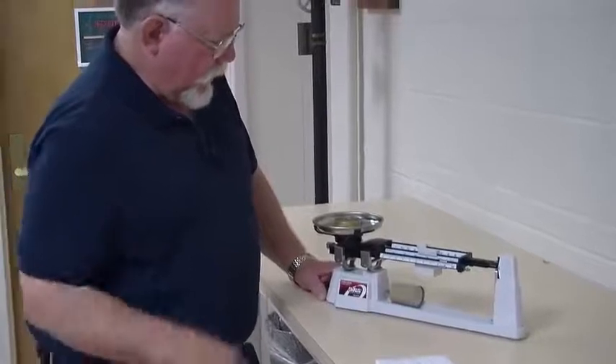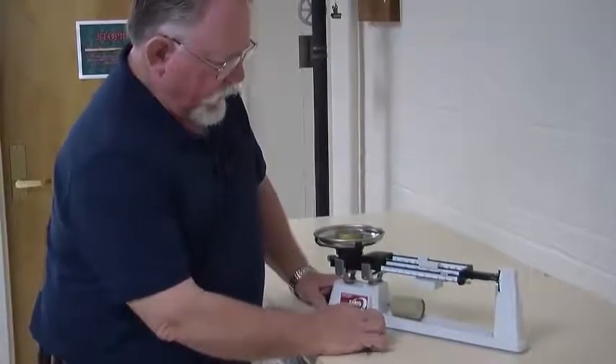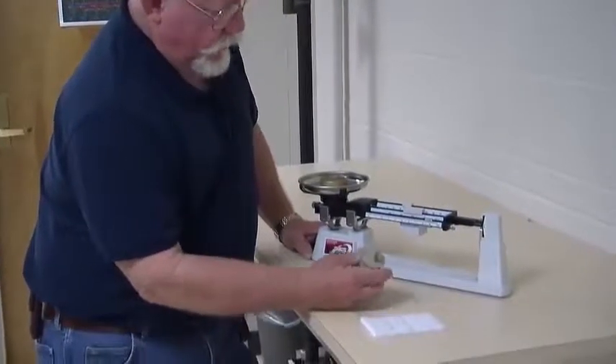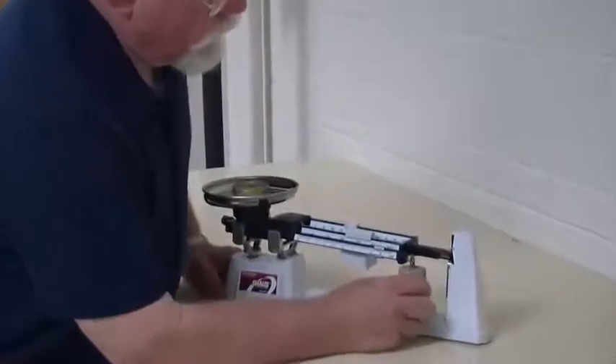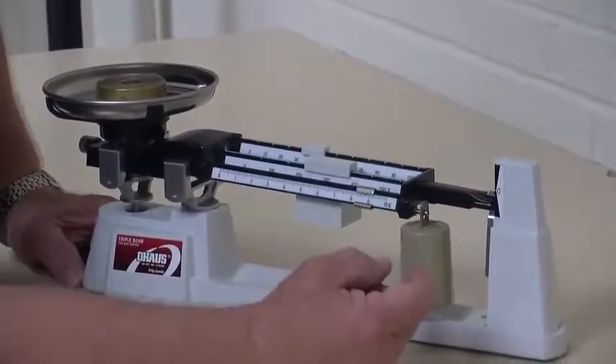Occasionally an object will be too large for the poise weights, in which case you'll need to use one of the auxiliary masses and hang it right here in the ring on the end support.